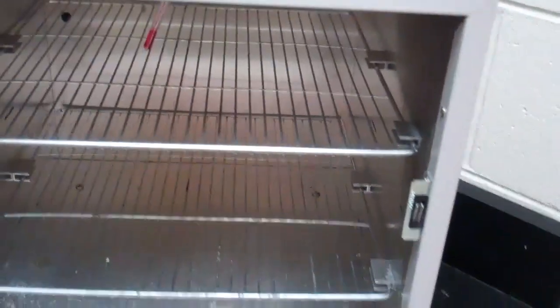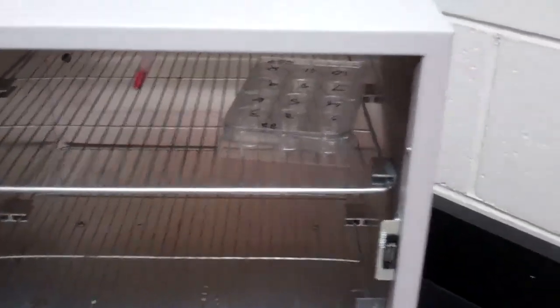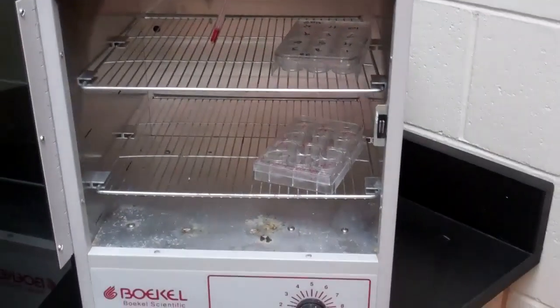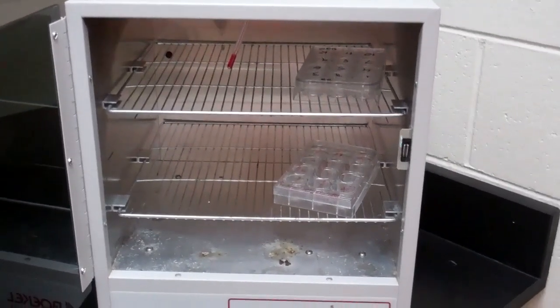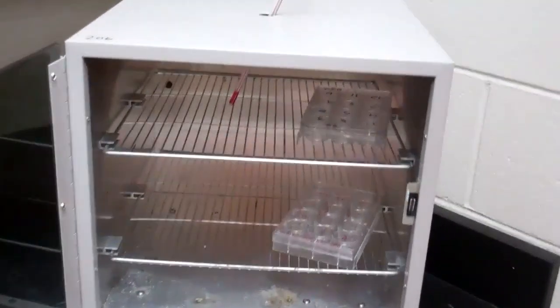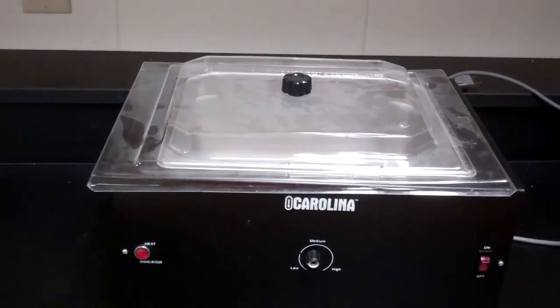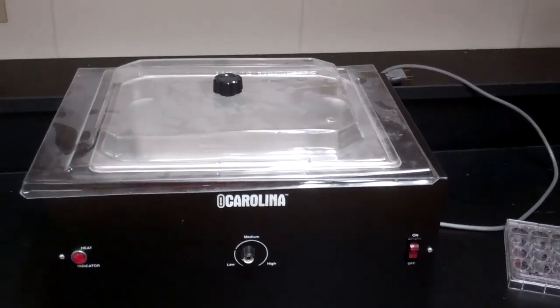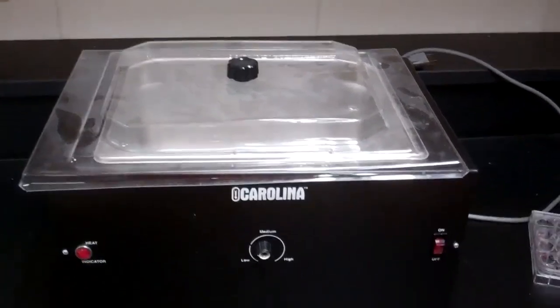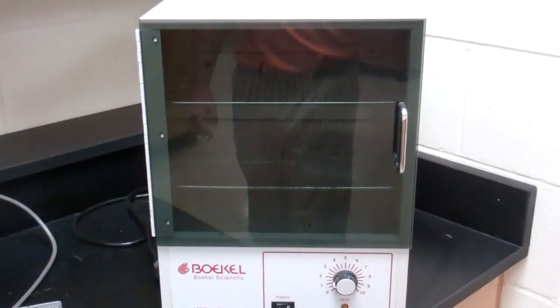So I went to this type of incubator, and the nice thing was I could control the temperature well, and I could put lots and lots of falcon dishes in here. The humidity levels were fine. Obviously with the falcon dishes, the embryos are already in water. On the other hand, the water bath limited the number of falcon dishes because you can only put so many on the surface, but it worked okay if you only have a few and that's all that you have. But in terms of incubating the eggs, I much prefer this.